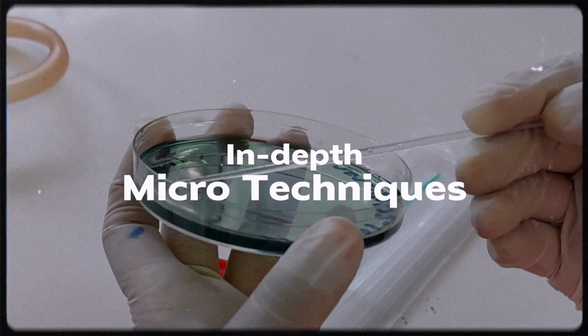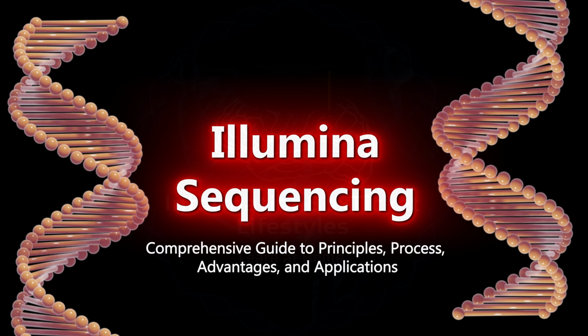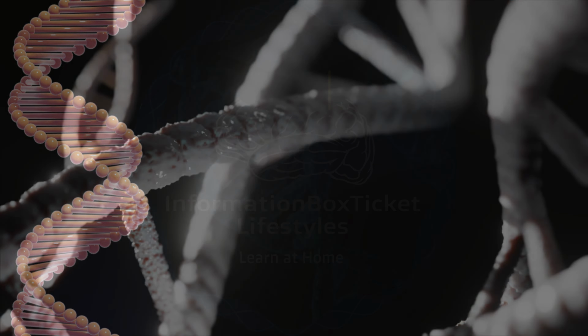Let's explore in-depth micro techniques and uncover groundbreaking insight together on this educational journey into the fascinating realms of microbes. Illumina Sequencing. Comprehensive guide to principles, process, advantages, and applications. Table of contents. Introduction. Principle. Steps. Process. Advantages. Limitations. Applications.